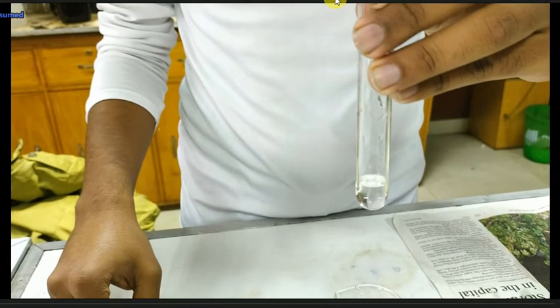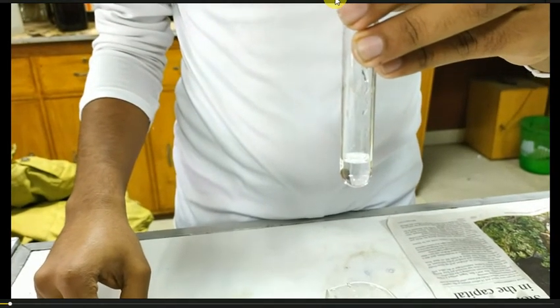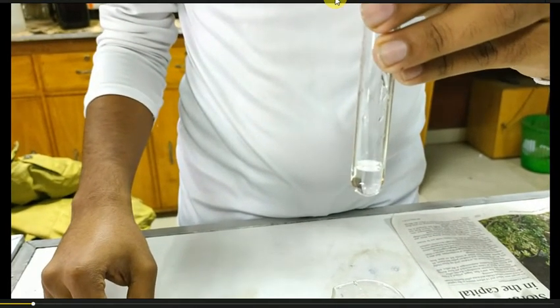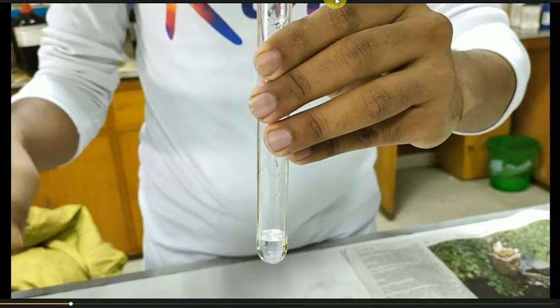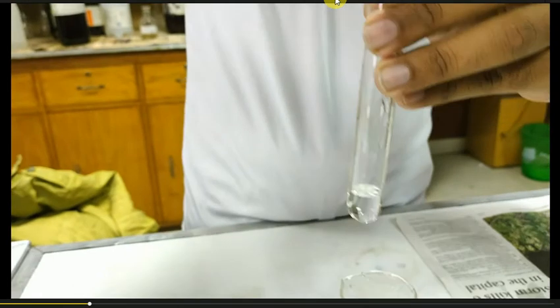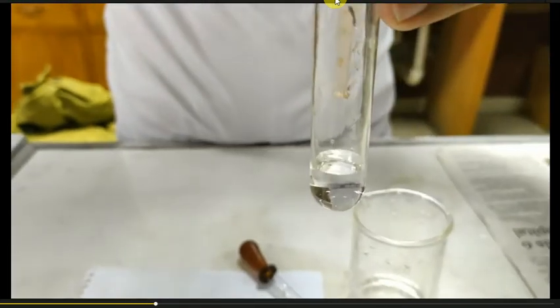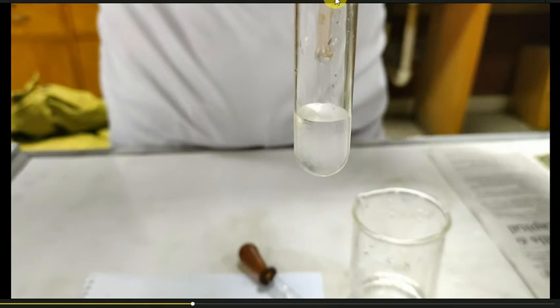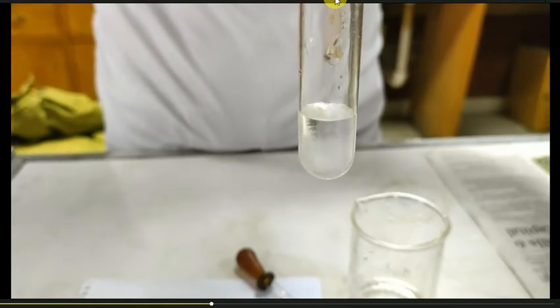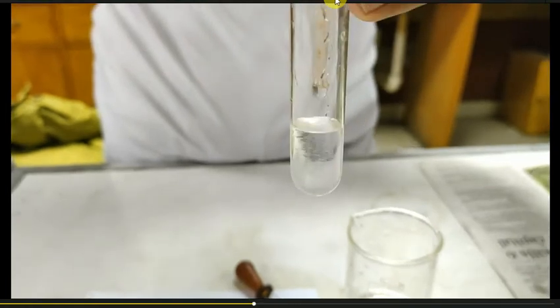Sample solution. In this case, we are going to test for the presence of zinc ion. The test for zinc and aluminium is quite similar. Now we are going to add dilute 2M ammonium hydroxide to this solution. This will produce a white PPT. The white PPT appears, but the excess ammonium hydroxide will dissolve the PPT.